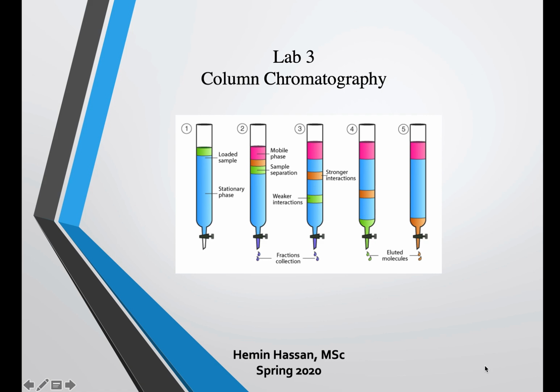As we have studied in the theory, we have stereoisomerism. Basically, we have enantiomers and we have diastereomers. Although we have chemical reactions apart from isomerism, all of them, the isomers, the diastereomers, the enantiomers, and the components of the chemical reaction can be easily separated with a powerful technique we call column chromatography or flash chromatography.